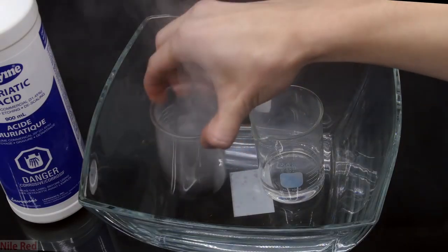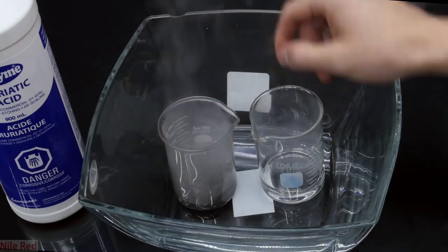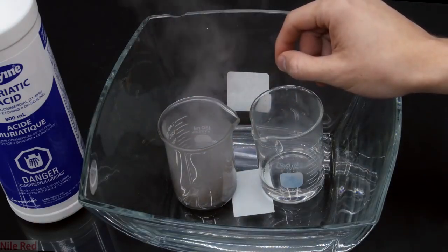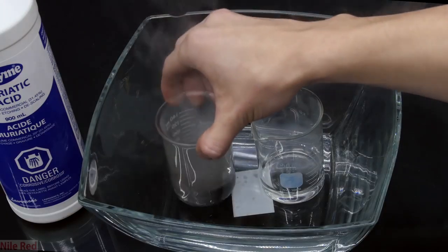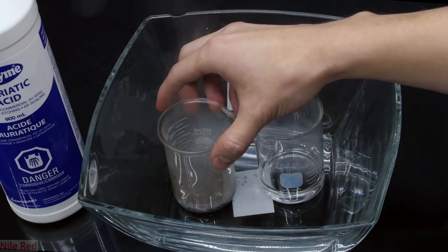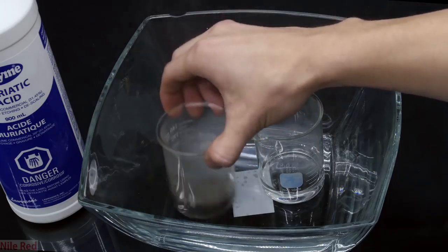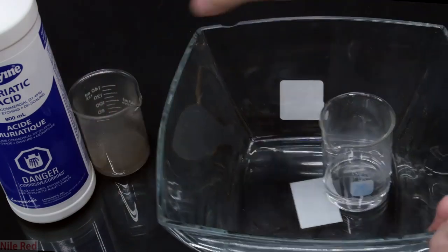I also purposely did this in one shot and kept my hand inside the frame the whole time, so that people wouldn't claim that I swapped out the beaker for water or something. Anyway, once everything's reacted, I figure I'm done with it and I move it to the side. I then decide that my left hand is the victim, and I start pouring the acid onto it.